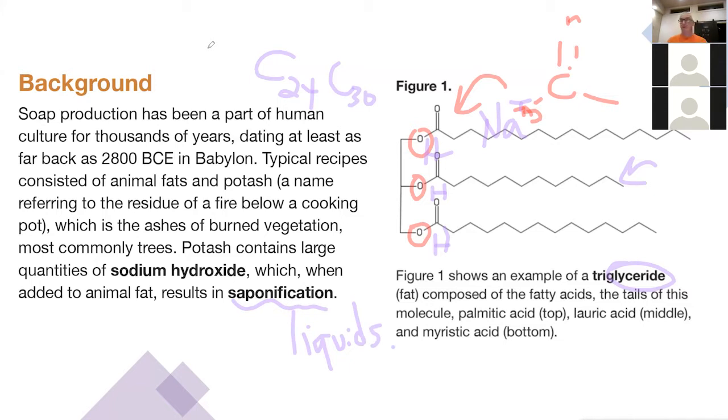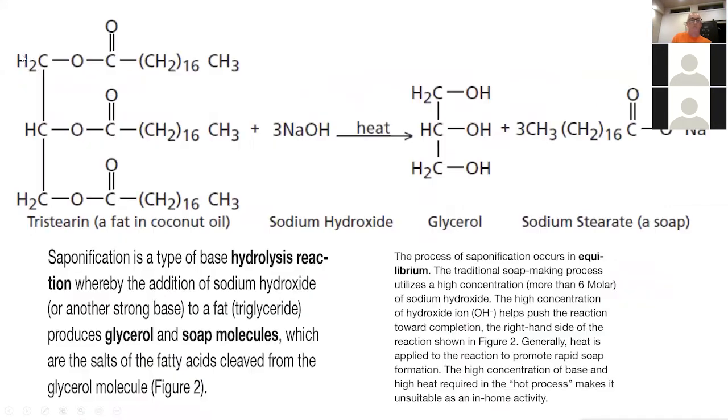That's where you get liquid soap from. So it depends on the length of the fatty acid chains. So here's the reaction. So this is a fat. A fat is just basically the fatty acids connected to glycerol. And they can be of a lot of different lengths. And they don't have to be saturated.